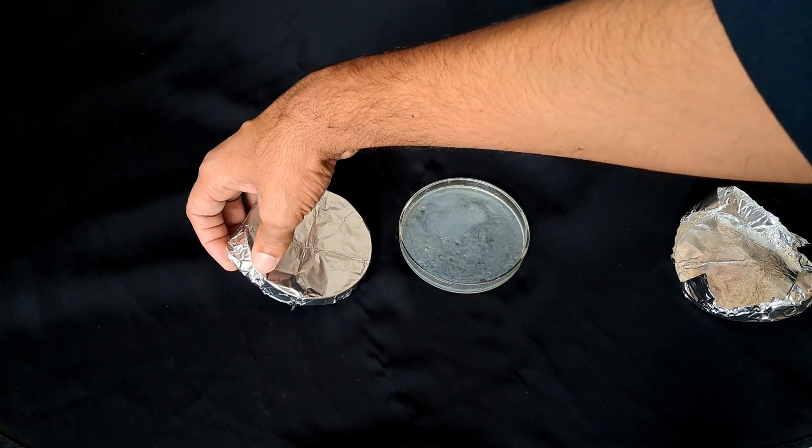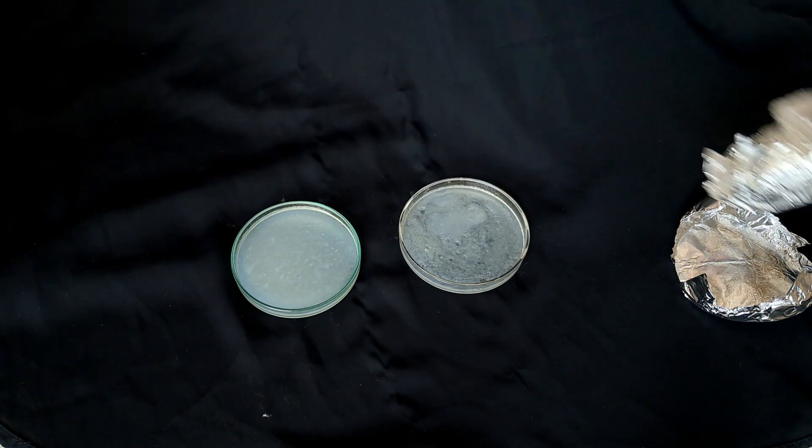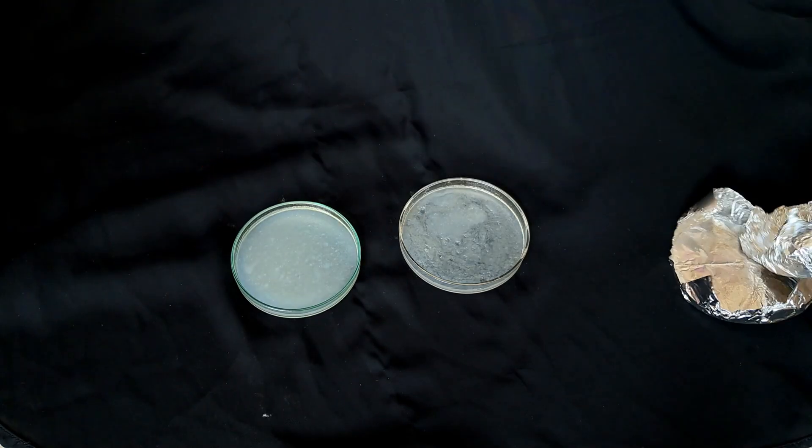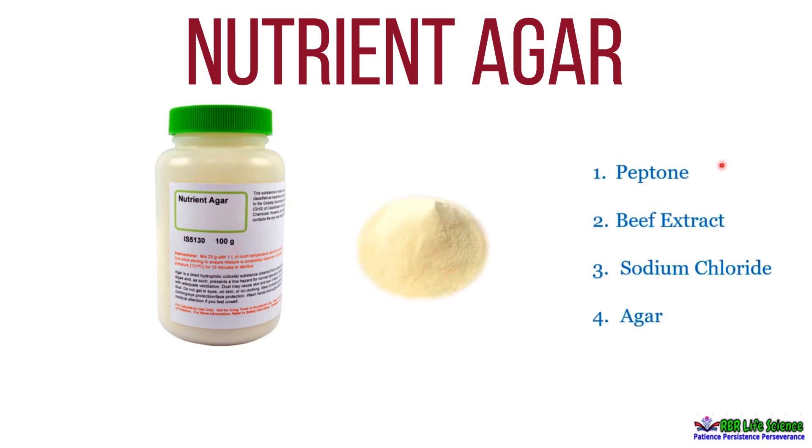After seven days, nothing had changed. So I searched for the reason online and came to know that the problem is with the agar solution.